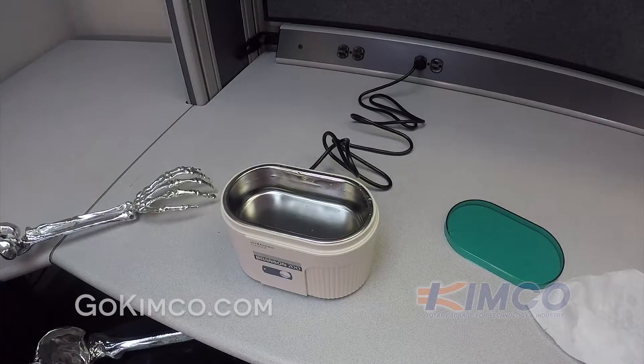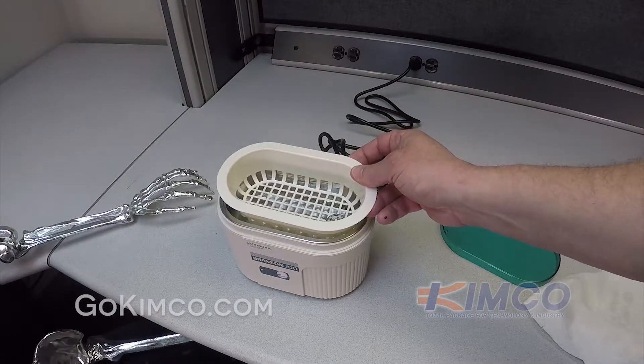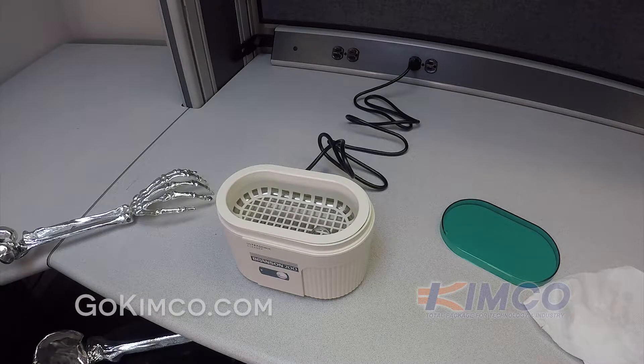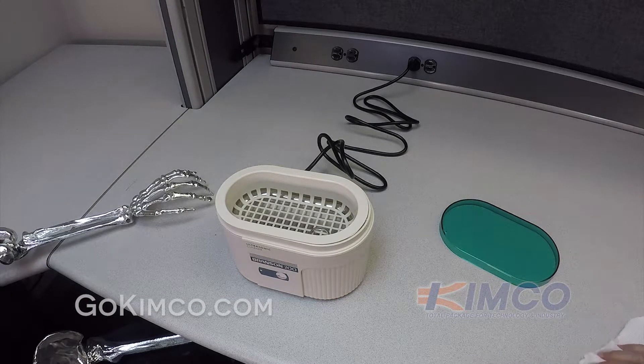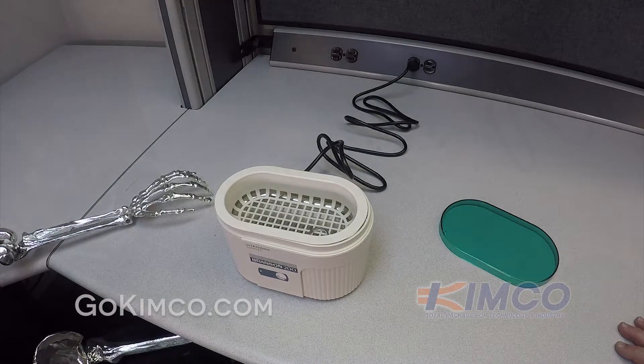So we've allowed the unit to run for about two to three minutes. Now we're going to place whatever we have to clean inside the solution. Depending on how dirty it is and what contaminant it is, it could take 30 seconds up to five minutes. If you need more time, when it turns off after five minutes, just simply turn it back on.